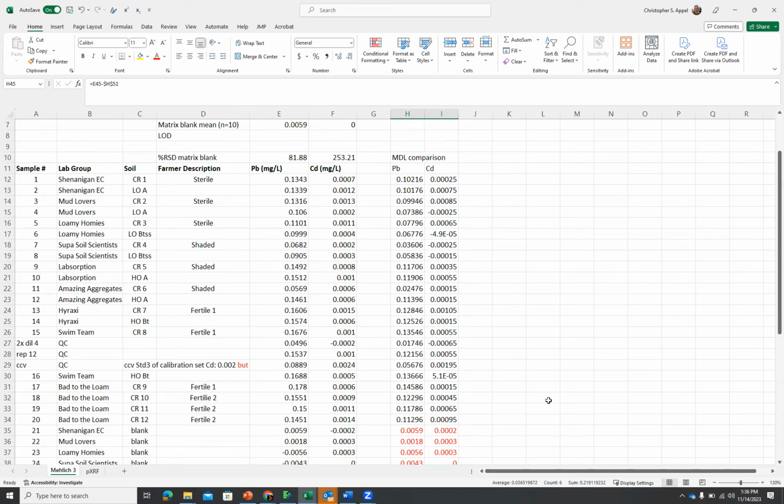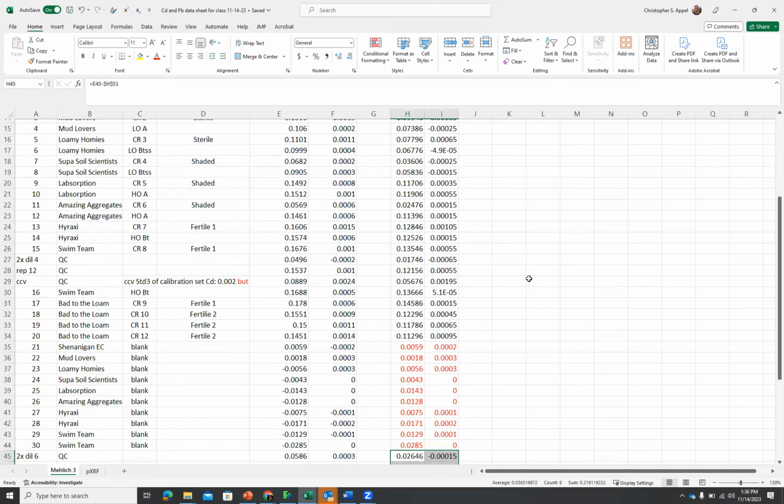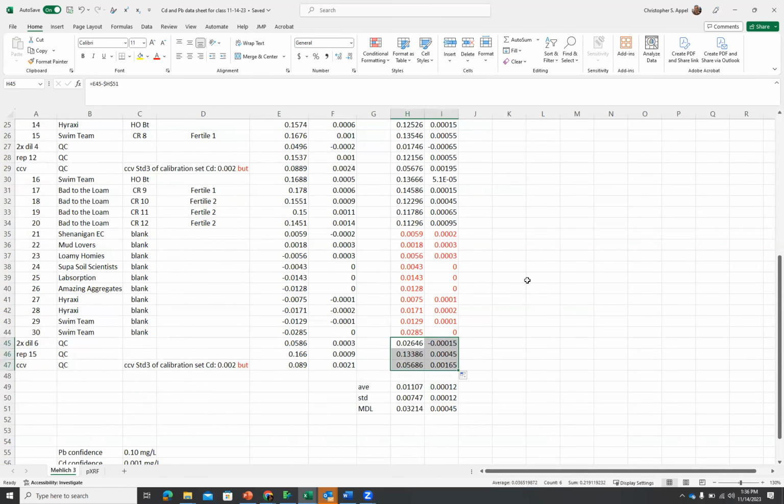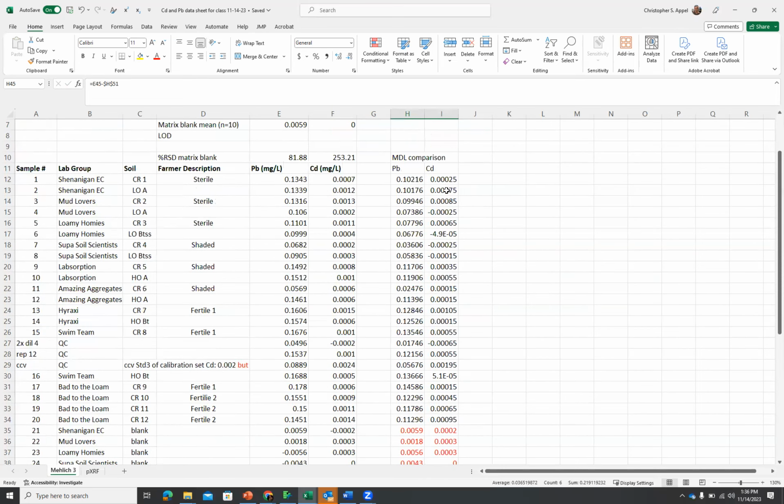All right, any questions? That makes sense why we did what we did? Yes. Fantastic. So do we have any negative values in our lead column? I don't see any. Do you? Do we have negative values in our cadmium column?